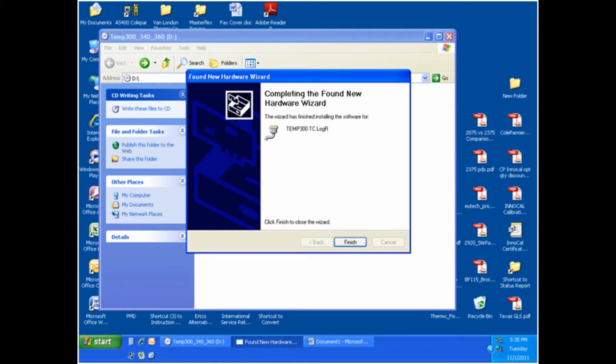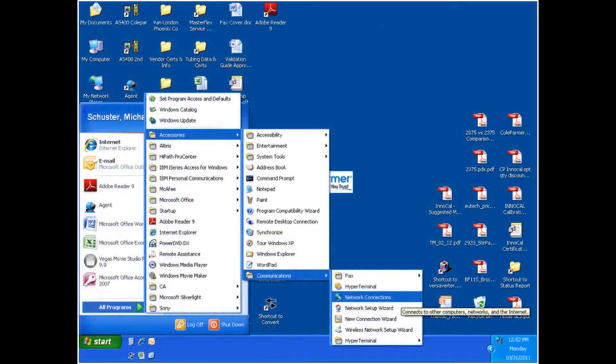To download the data to your computer, turn on your meter and then connect it to your computer via the USB cable. Make sure that you turn your meter on before connecting to the computer, or you will be unable to download the data. On your computer, go to the start menu, all programs, accessories, communications, and then click on the icon for HyperTerminal. The program will prompt you for your location information, but this is unnecessary and can be skipped by clicking cancel.